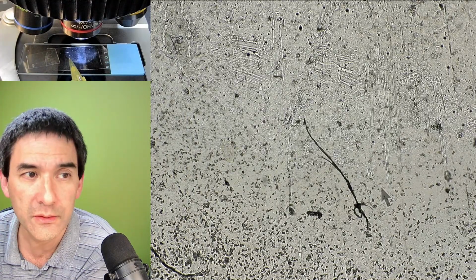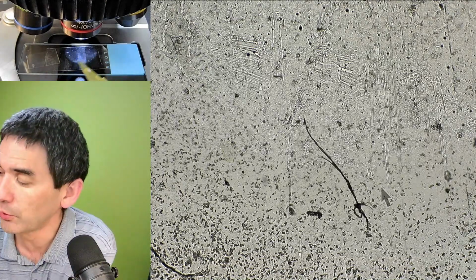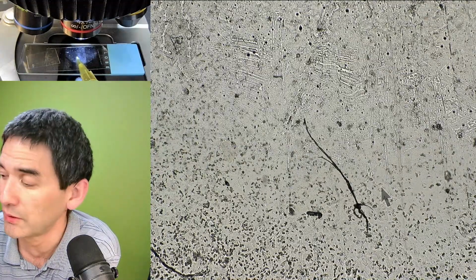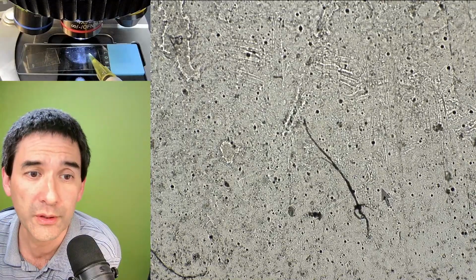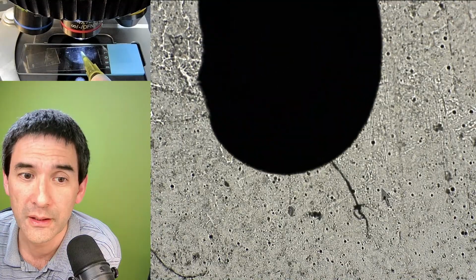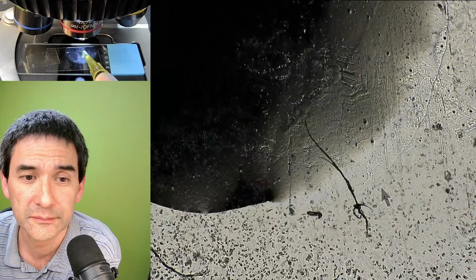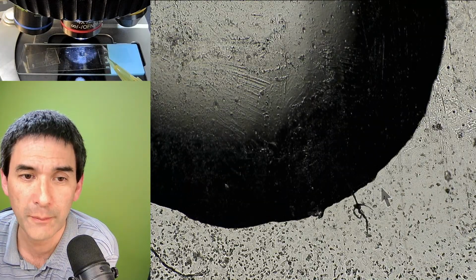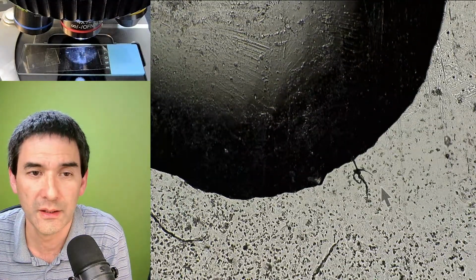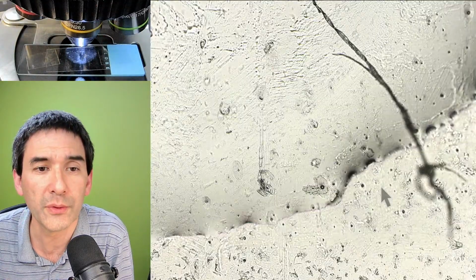You can actually see what I'm doing up here. I'm taking the tip, resting it on the tape to give it some stability, and moving forward until I hope to be able to, here, see, that's the tip, and I press. And now it just got covered. Yeah, okay. So you see, because of the refractive index of the oil, I'm not able to see it.